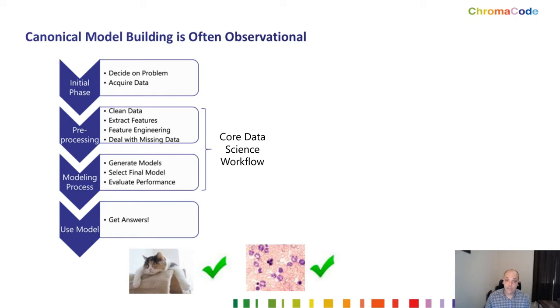And if the answer is yes, then you can take that model and put it into production to go get answers. Again, in the case of image classification, your Google search or your Facebook image tagging. And in the case of cells, trying to predict for a new sample whether that contains some pathological cells, whether they're tumor cells or something of the like. And in our case, whether the PCR signals have target 1, 2, or 3 that are present in a particular sample, and how you deal with other features of the data set, like the wells of the PCR plate, or the non-uniformity of lenses, or other things that we need to correct for in order to make sure that we get the right data every time.